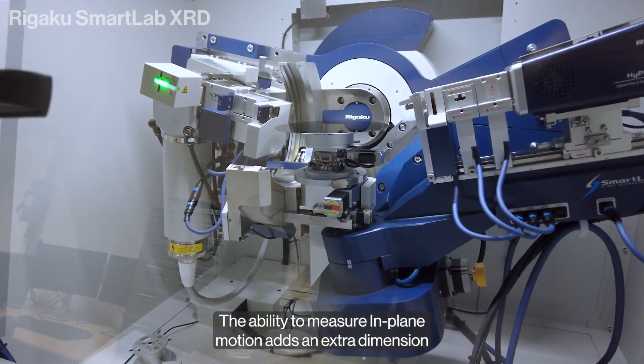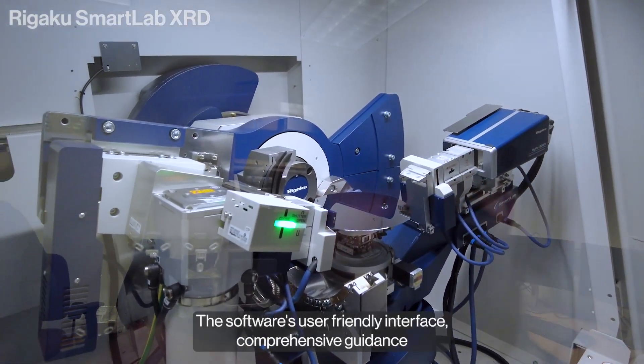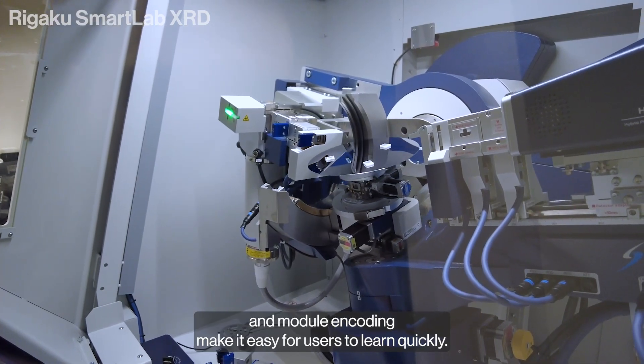The ability to measure in-plane motion adds an extra dimension to the measurement, benefiting those who require it. The software's user-friendly interface, comprehensive guidance, and module encoding make it easy for users to learn quickly.